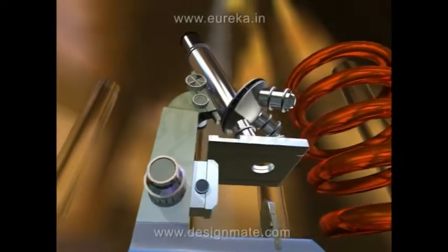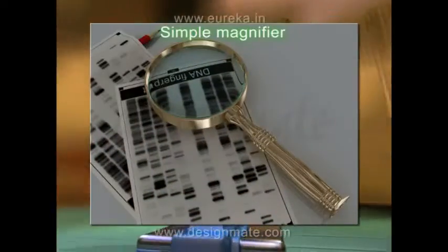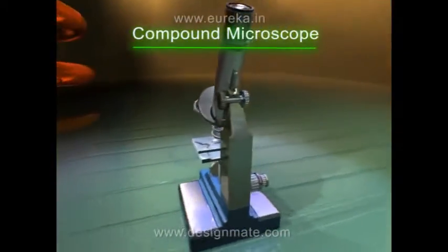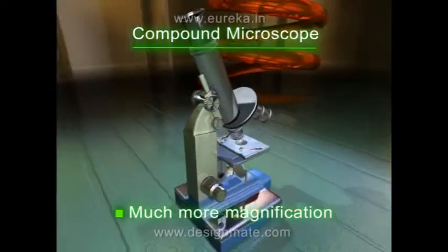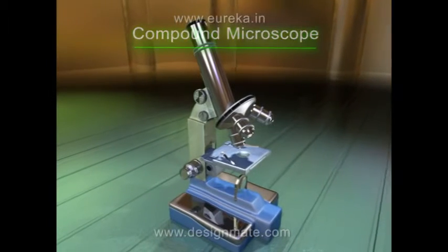Well, that is the magic done by a compound microscope. A simple magnifier has limited magnification, but a compound microscope has much more magnification. Now, let us study the compound microscope in detail.